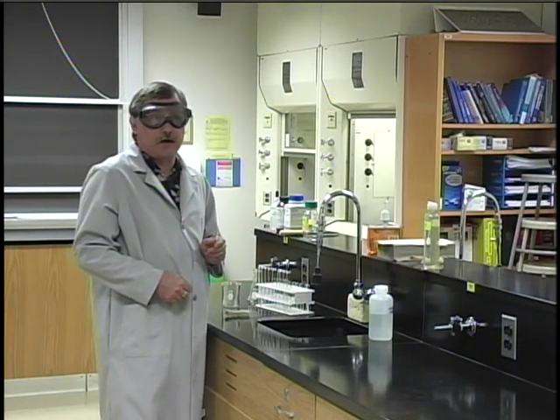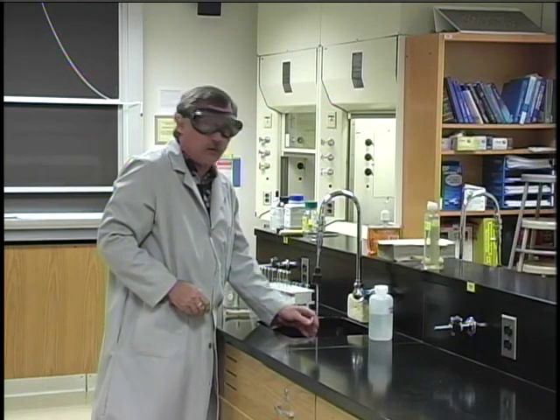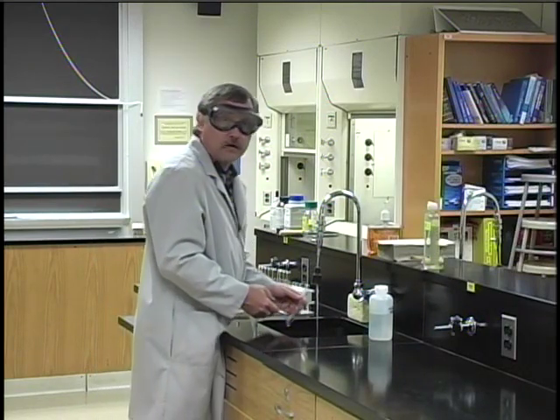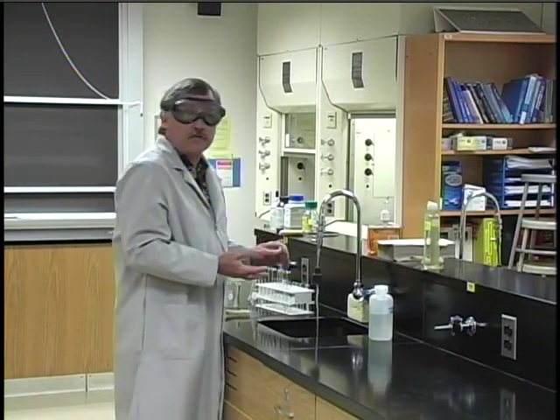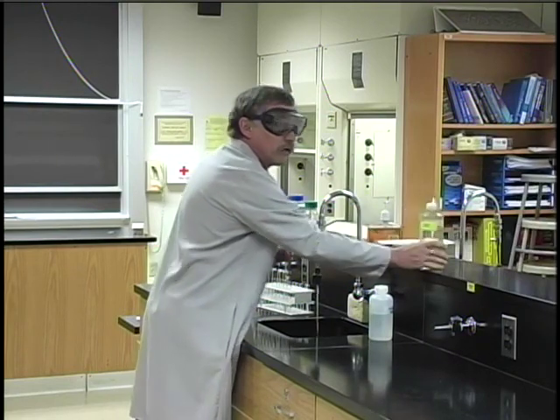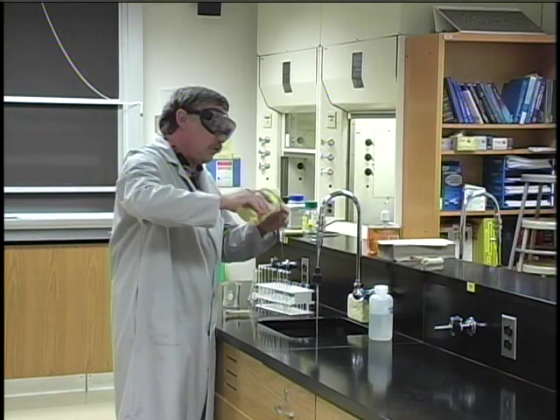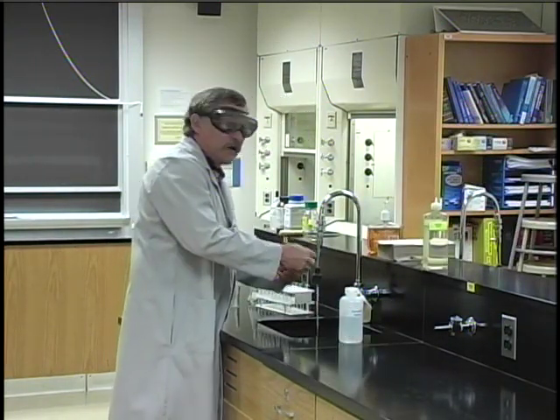Clean glassware is really important in a chemistry lab. When you're finished with your experiment, after you've disposed of whatever chemical was in the glassware, the first thing you do is rinse it a few times with tap water to get the excess chemical out — there's no sense in using deionized water at this point. Sometimes you may need a little glassware cleaner; it's labeled and it's on the pedestals.